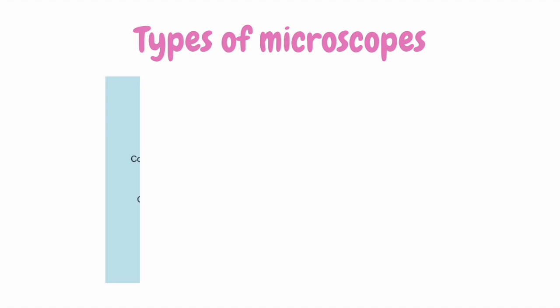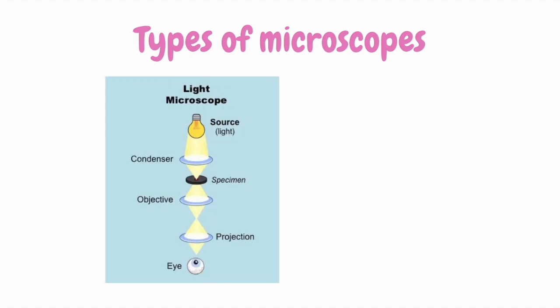A light microscope uses visible light to magnify biological samples with the highest magnification of between 1000 and 1500. A light microscope was the first microscope to be created during the early 1600s by Zacharias Janssen, and it was used to make multiple discoveries in biology, such as the existence of bacteria.